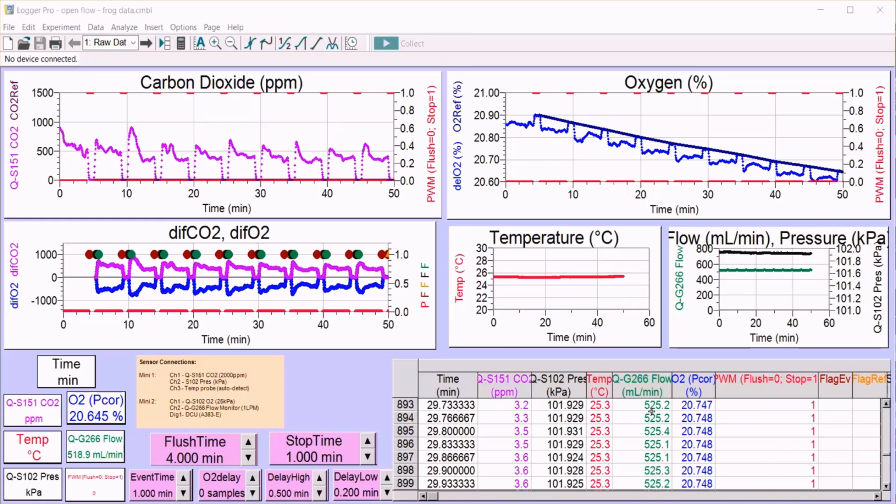So maintain your flow rates lower than 650 if you're working with animals that require higher flow rates because they're very active. Then a second gas pump would have to be set up to subsample from the gas which leaves the chamber and deliver to the analyzers at a lower flow rate.